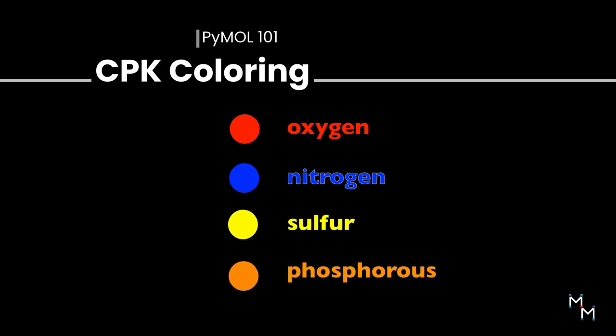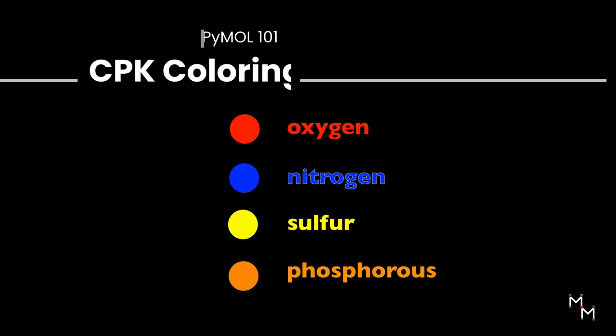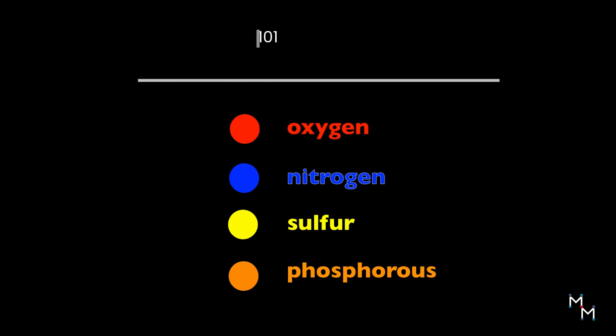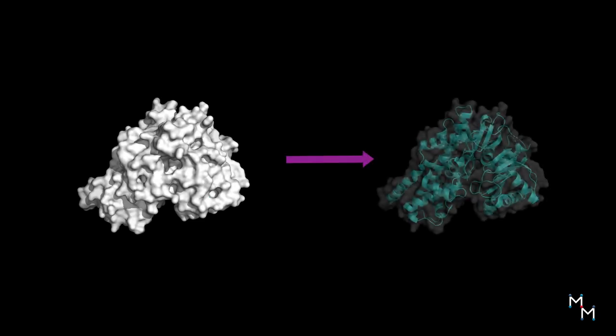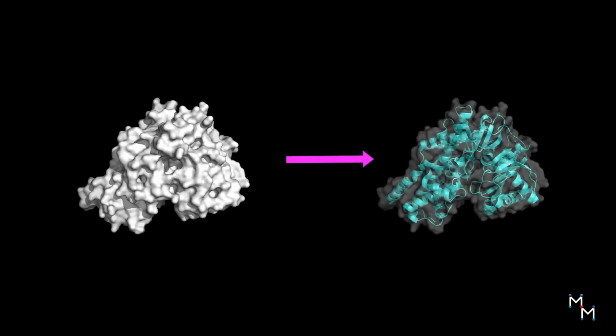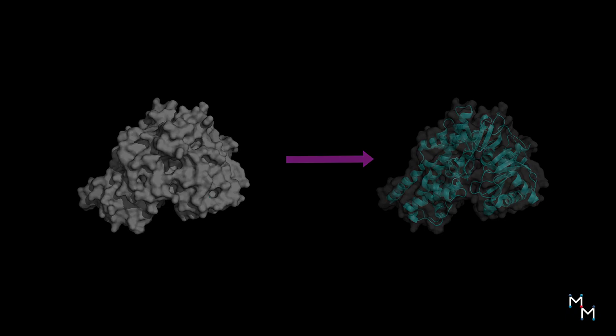Sometimes it's useful to override this, especially to look at the overall structure of a macromolecule. We'll also explore transparency in this lesson to make our colors shine through. Let's do this.